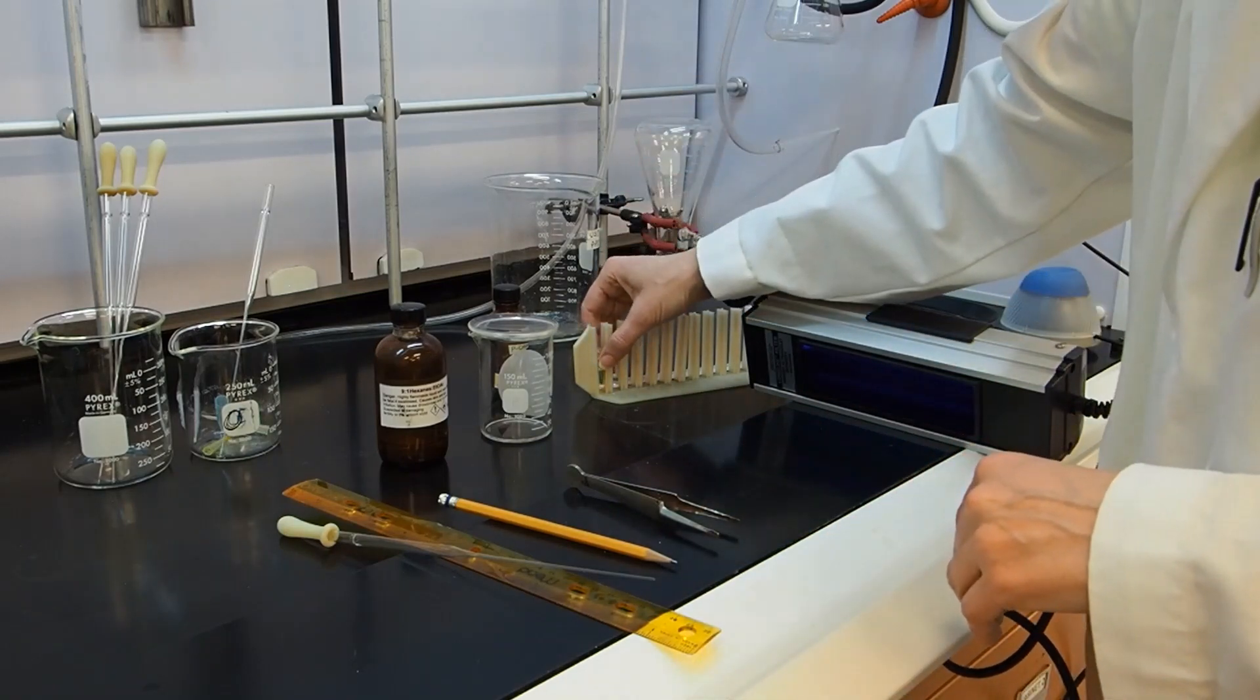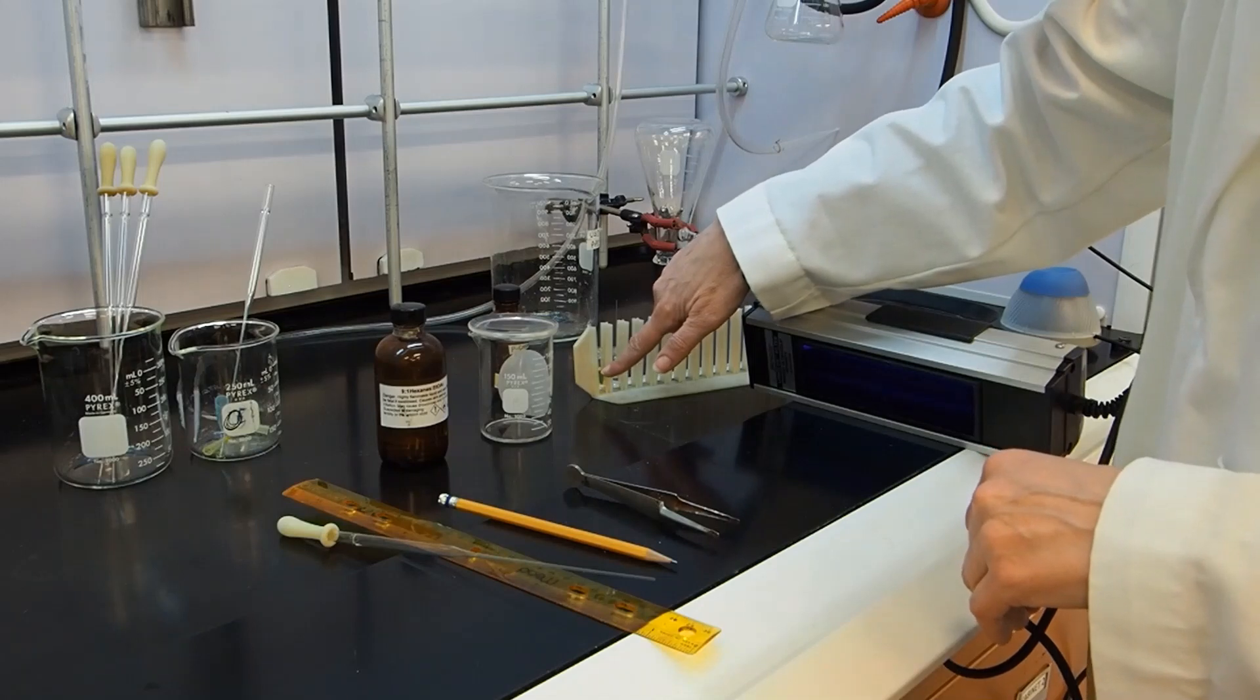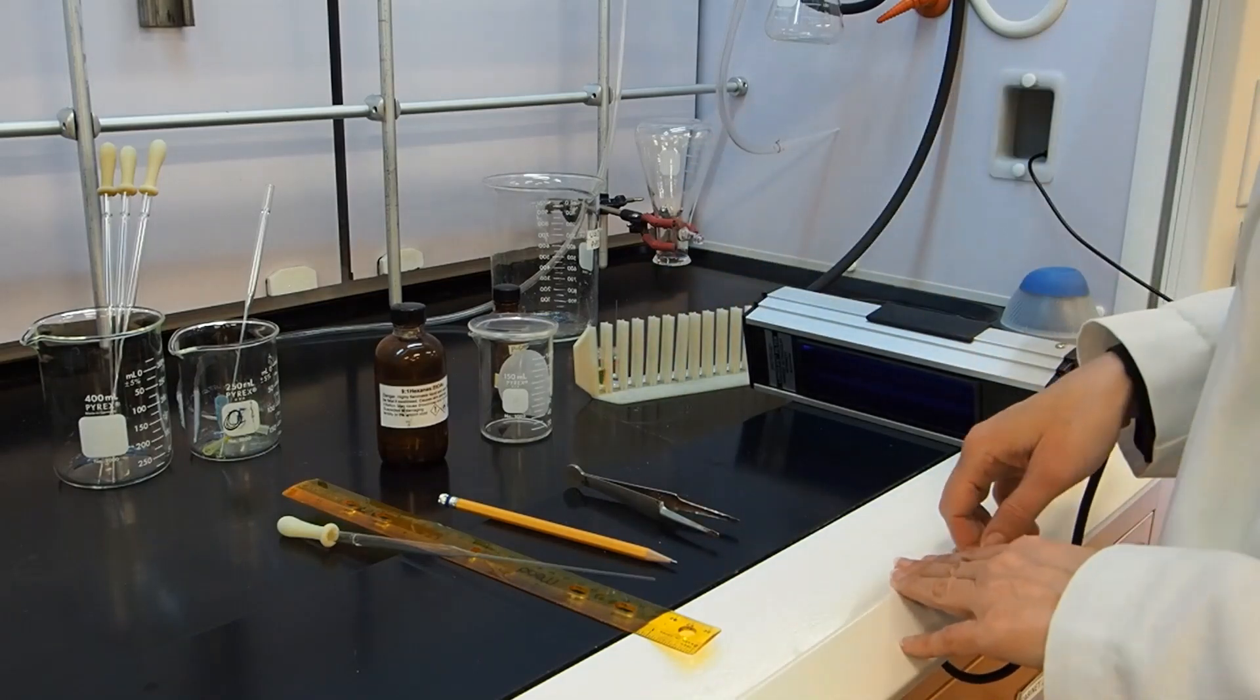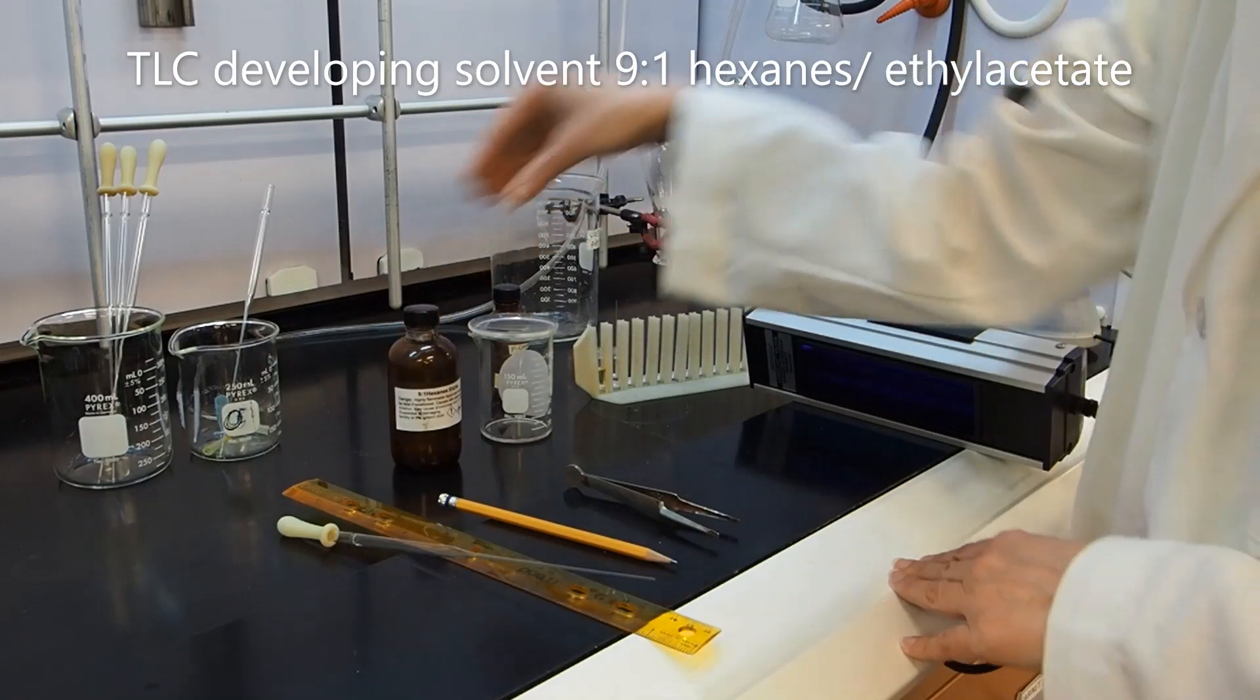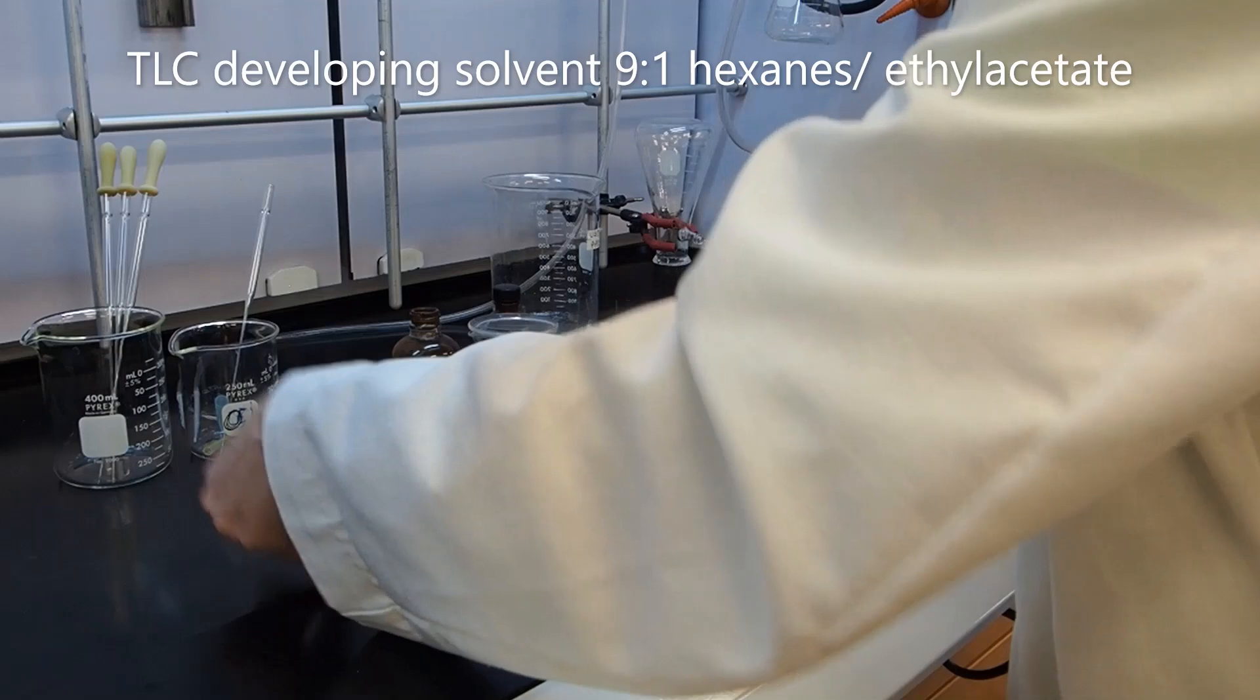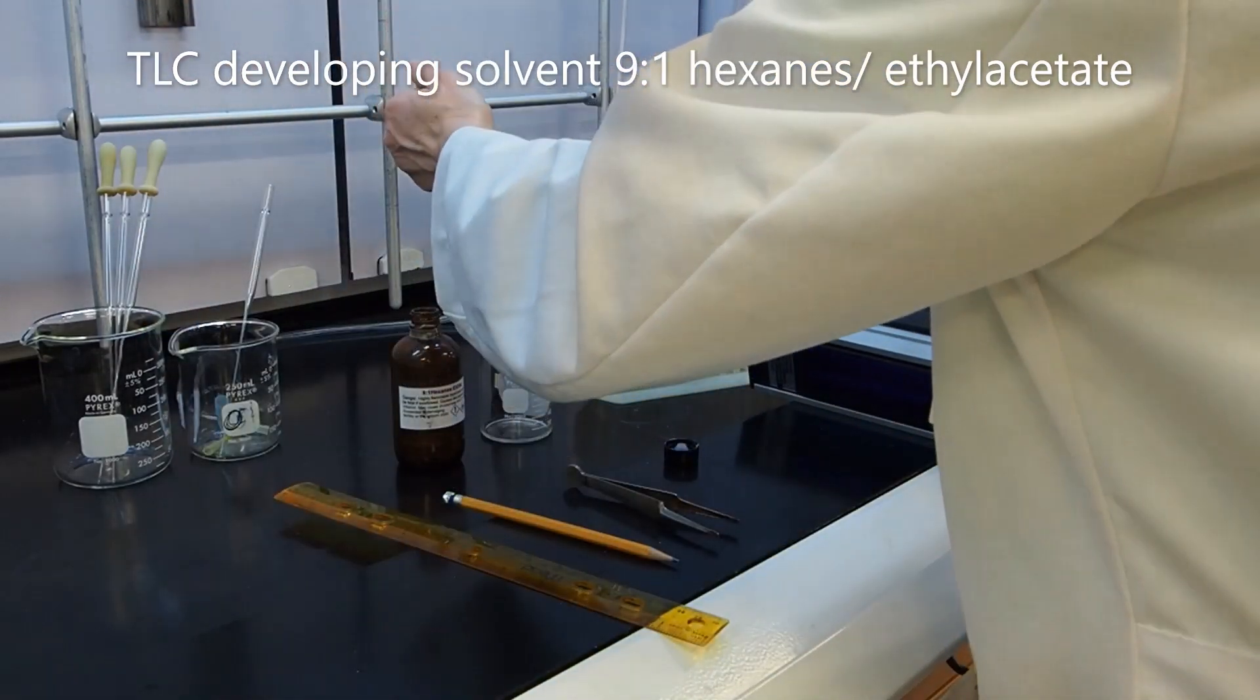I have another small vial with a drop of p-cresol. Both the p-cresol and the reaction mixture drop have been diluted in the TLC solvent, which is 9 to 1 hexane ethyl acetate. I'm going to add some of that to my TLC chamber, which is just a beaker with a watch glass on top of it.